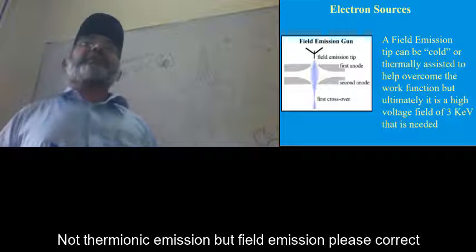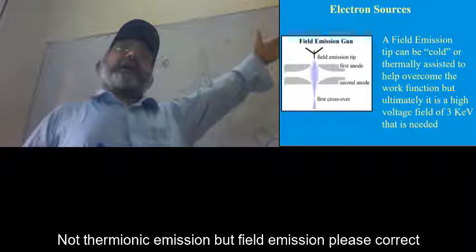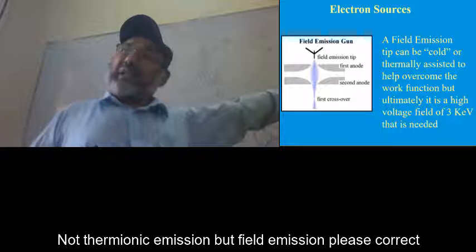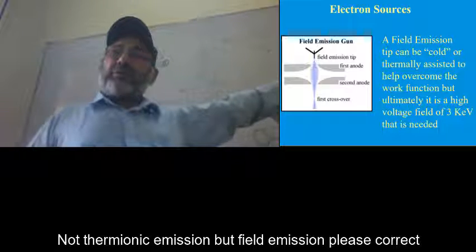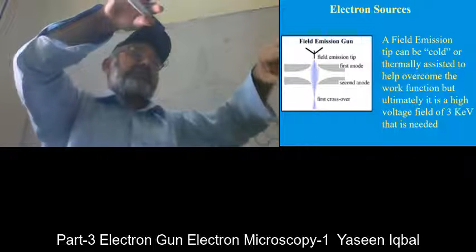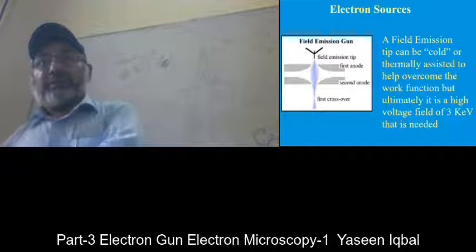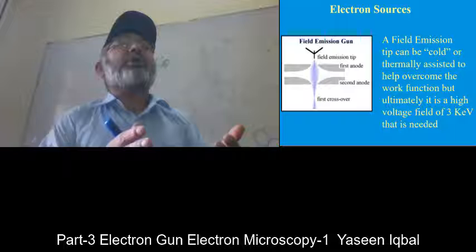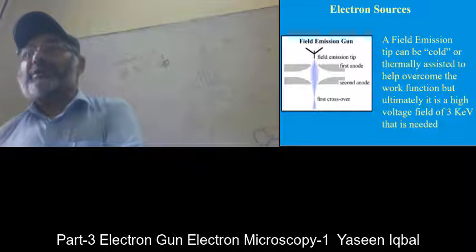And then, through the potential difference, you bring it down to the column of the electron microscope. Now, somebody is dropping water and you are collecting them and taking somewhere. And in another case, there is a pond of water and you collect water from there and take it somewhere.